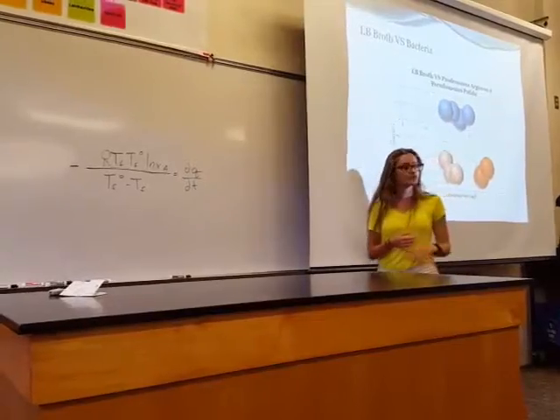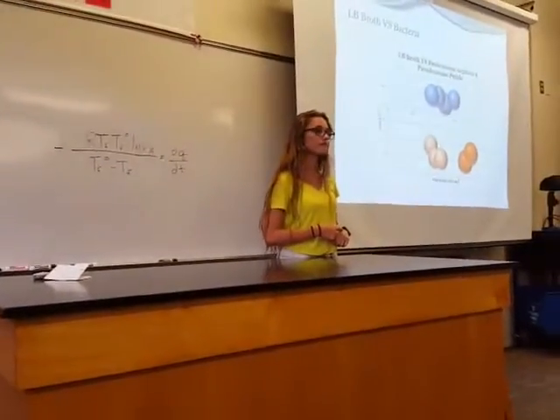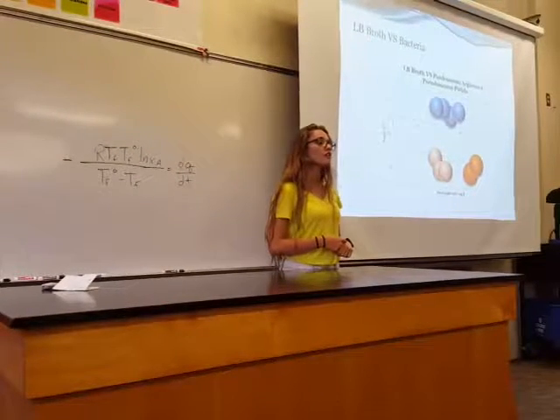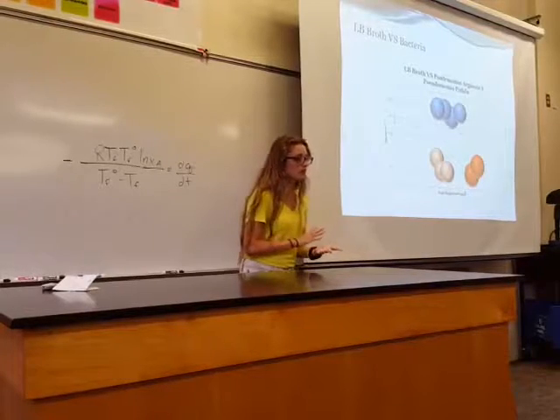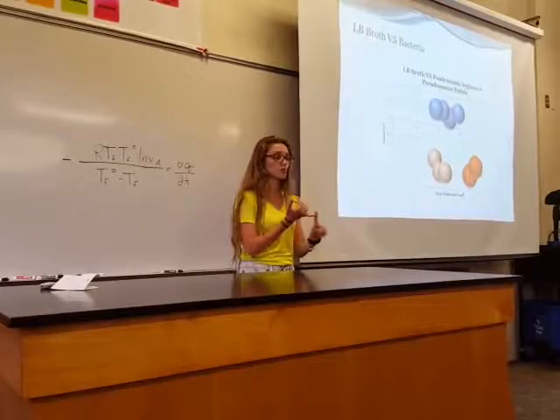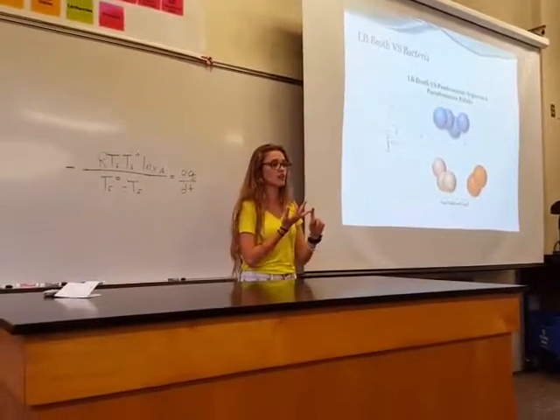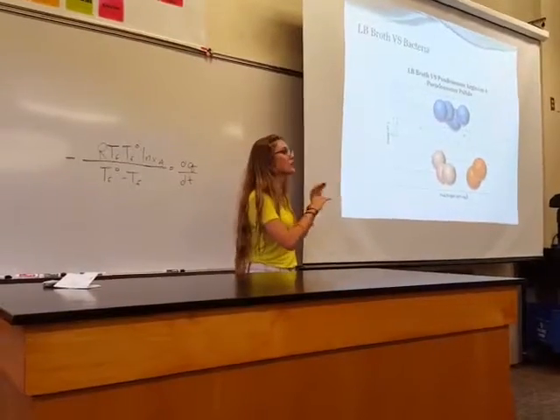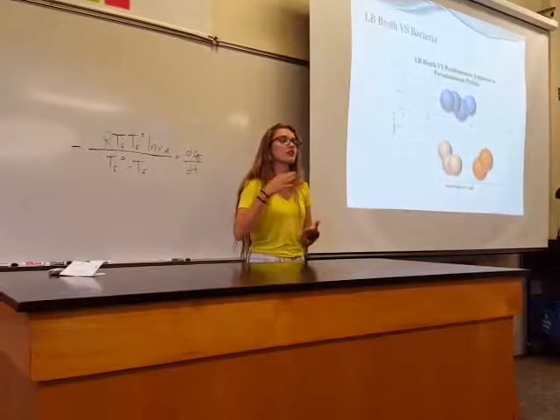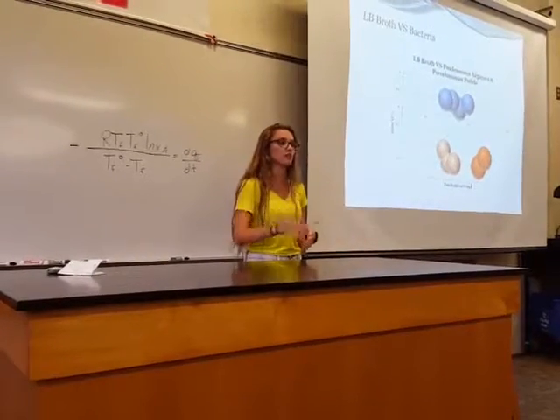I'm a little confused, because you're going to heat this up to grow the bacteria? It seemed like the whole presentation was about cooling it, freezing temperatures. The freezing part was mostly to understand the supercooling effects in the beginning, but also, because the differential scanning calorimeter measures phase changes, it does need to be frozen so that it can melt and we can get the information from the melting curve.